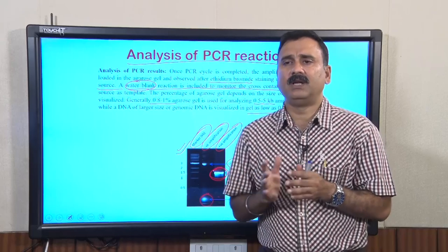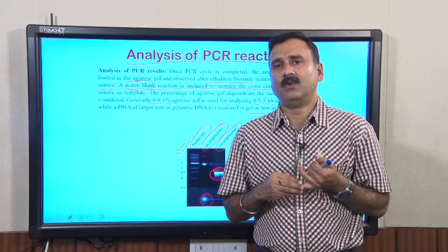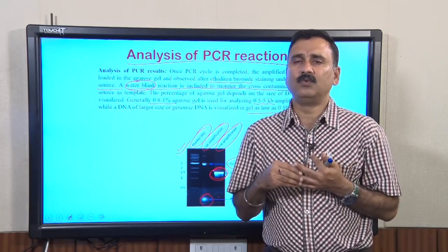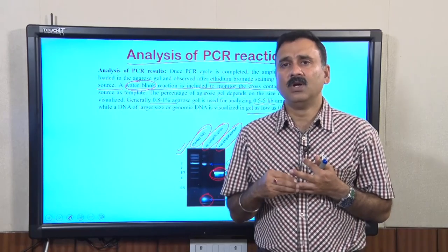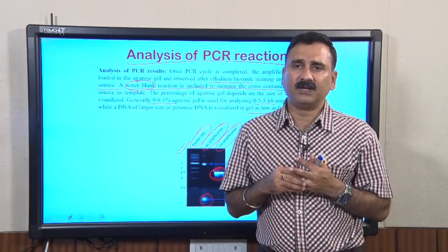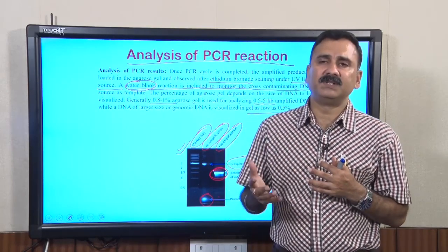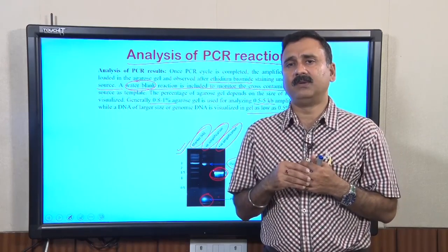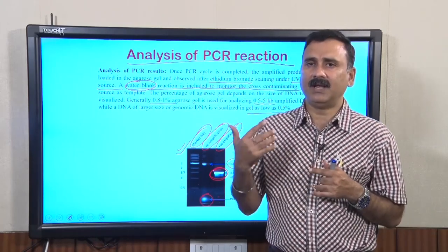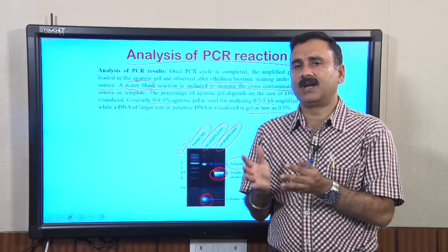Apart from this, we have some technical topics to be discussed. In the subsequent lecture, we are going to discuss three aspects related to PCR. Number one, how to design the primers, how to analyze the primers, and how to verify that the primers you have designed are good for PCR reactions. Number two, how to set up the reactions, what a typical thermal cycler looks like, and what precautions you should take while setting up PCR reactions. And the third is how to prepare an agarose gel, how to analyze your PCR reactions, and how you will know that your PCR amplified product is correct or wrong.